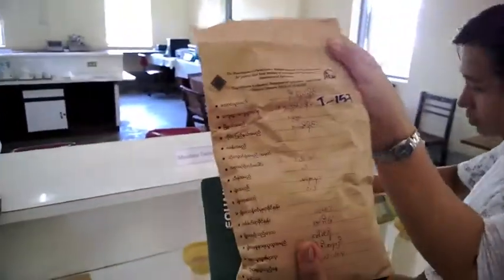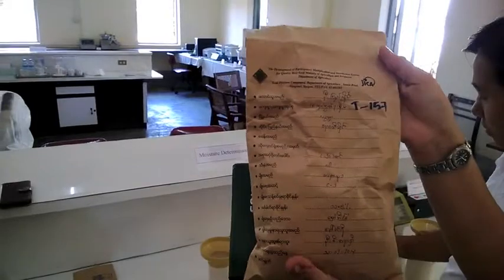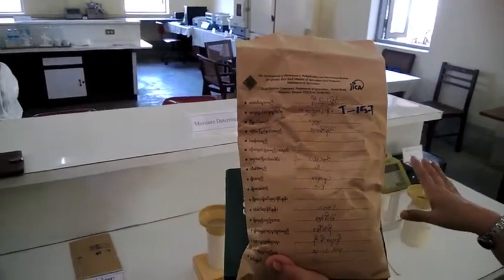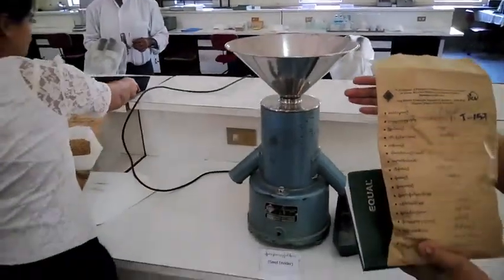They submitted the sample from Jaica. We measure moisture determination. After that, we will do analysis.